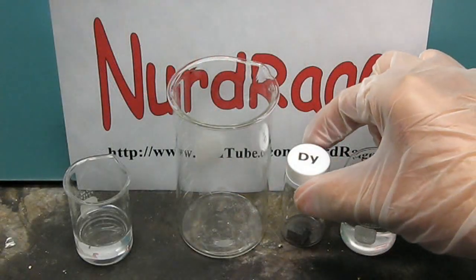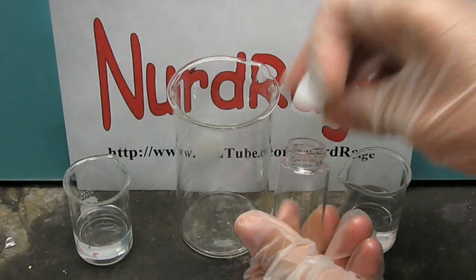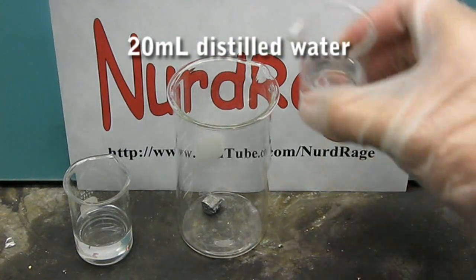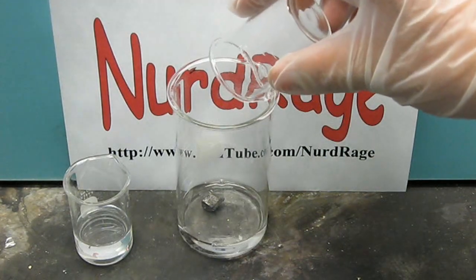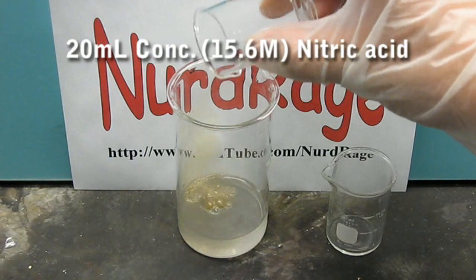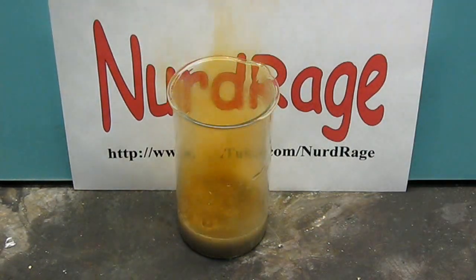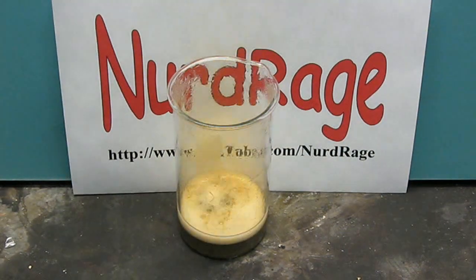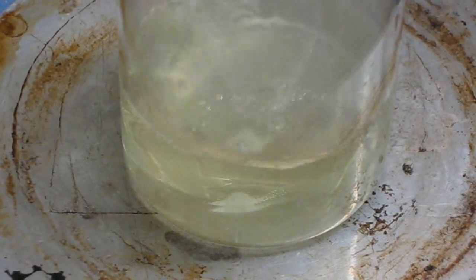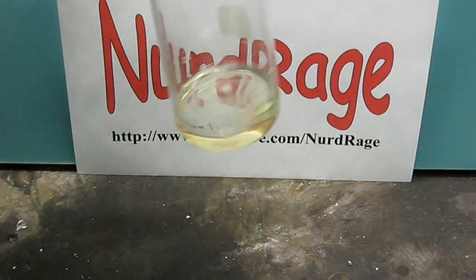Now let's do dysprosium nitrate. Here is a 5 gram sample of dysprosium metal. Place it in the beaker and then add 20 milliliters of pure distilled water. As you can see, dysprosium is much less reactive than europium. To get it going, directly add 20 milliliters of concentrated 15.6 molar nitric acid. As it reacts it will produce nitrogen dioxide. Once again let it react until it's just a suspension of metal particles, then boil it until it completely dissolves. Now you have a yellow solution of pure dysprosium nitrate with nitric acid.